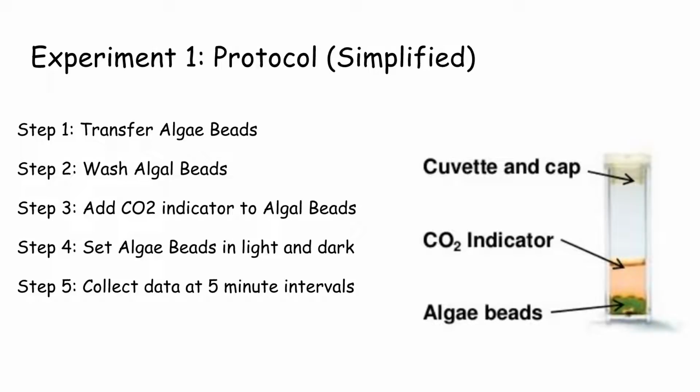The first step is going to be to transfer the algal beads right from their little home in a mini beaker on your desk. You're then going to wash the algal beads with distilled water. You're going to add carbon dioxide indicator to the algal beads, and then you're going to set them in the light and the dark. And you're going to collect the data every 5 minutes into the shared Google Sheet, which you can find in the HyperDoc.